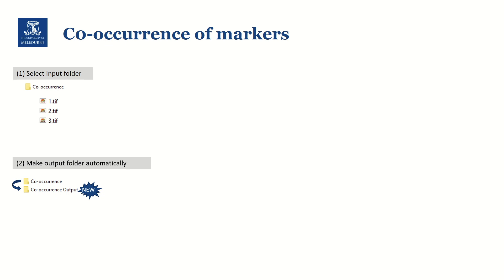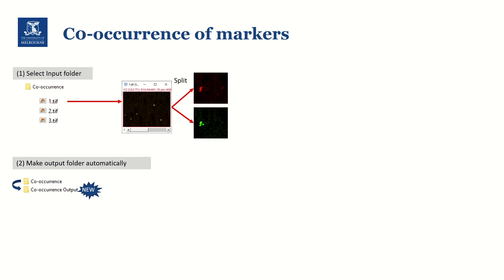In this script, we will first select the co-occurrence folder as our input folder, and as we did in the previous example, we will generate the output folder automatically. In this co-occurrence folder, we have three TIFF images, and each image has two channels — red and green — so we will split the channel. From these two channels, we would like to know how many cells are green positive, red positive, and double positive. For example, one cell is positive to both green and red, another cell is only positive to green, and another cell has very faint green but strong red. So depending on the threshold, that cell will be counted either as red positive or double positive.